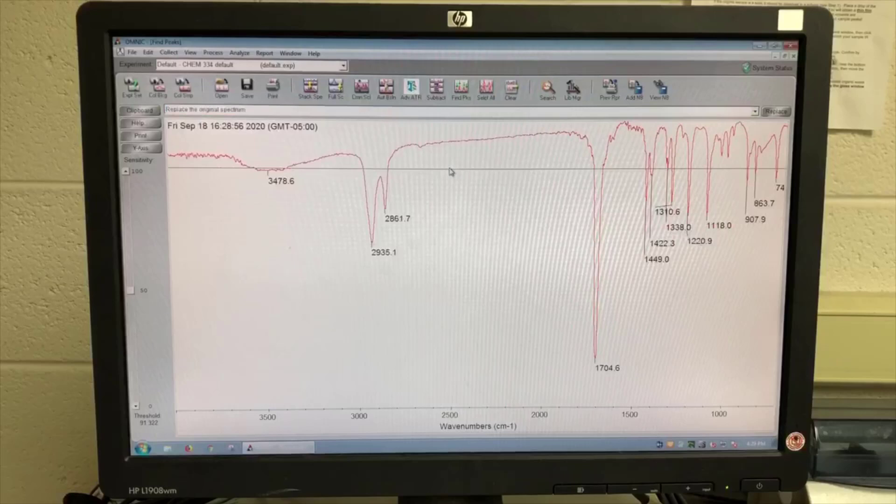Now I'm pressing the Find Peaks button, and I'm clicking up higher to see all of the peaks in the functional group region. At this point, you should take a screenshot of your spectrum, save it to a flash drive, and walk it back to your bench.